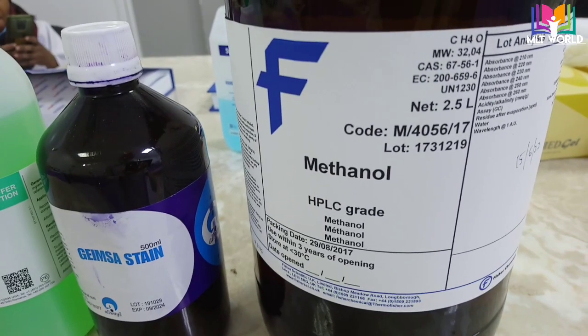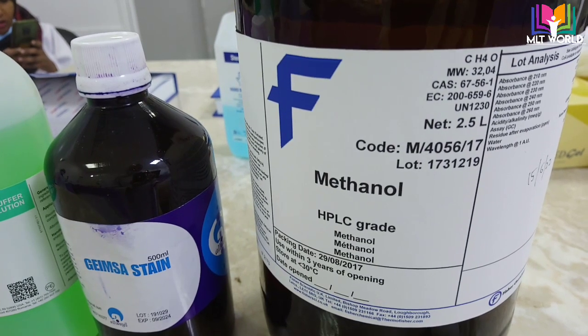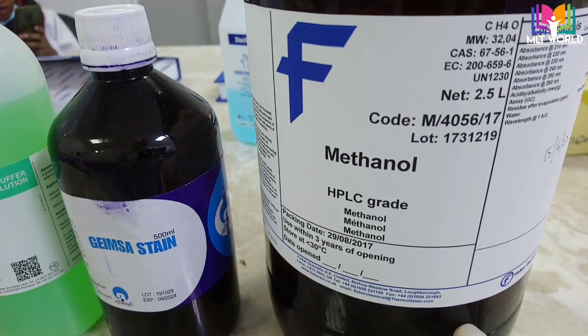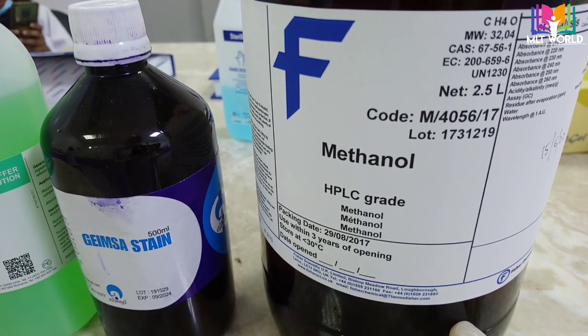Welcome back friends. Today in this video I will show you how to make a blood smear, then how we will stain it, and how we will read it under the microscope. The stain I am using is Giemsa stain.